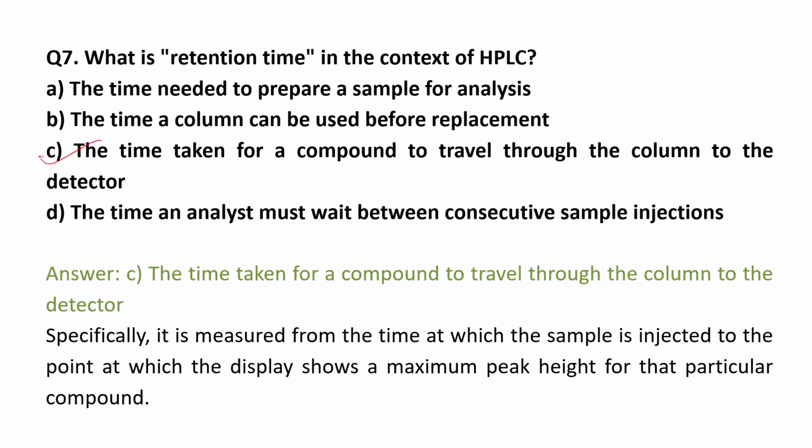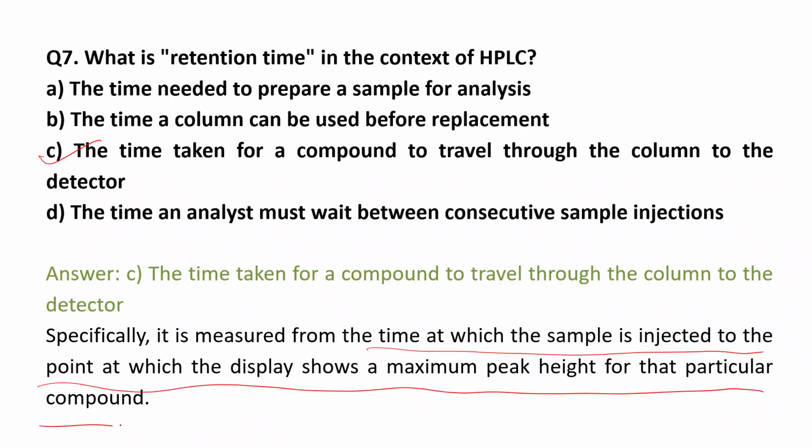So that's the definition for retention time. The time at which sample is injected up to the point at which display shows a maximum peak height for that particular compound.